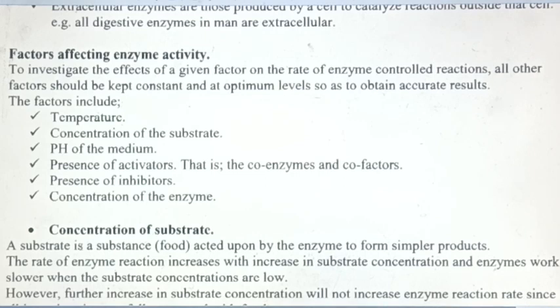We're able to view that when enzyme catalase is added to a solution of hydrogen peroxide, we have effervescence of colorless bubbles, and those colorless bubbles were coming from the decomposition of hydrogen peroxide, which gets broken down into water and oxygen gas. So we are looking at enzyme catalase breaking down hydrogen peroxide to oxygen and water.